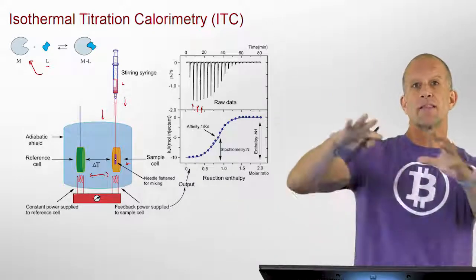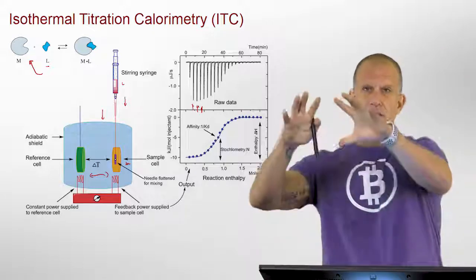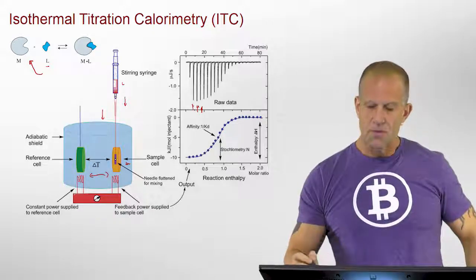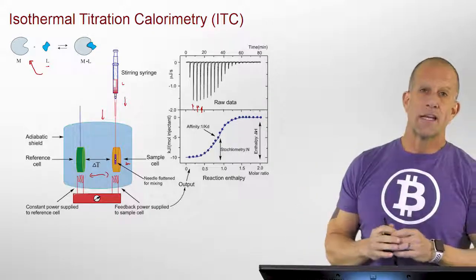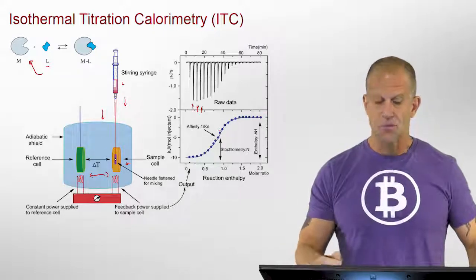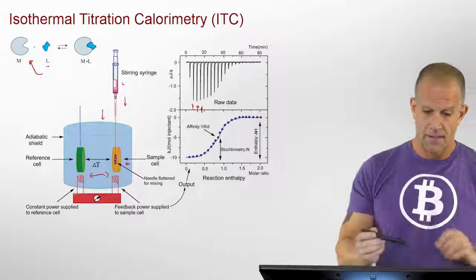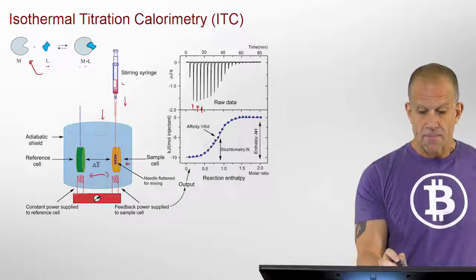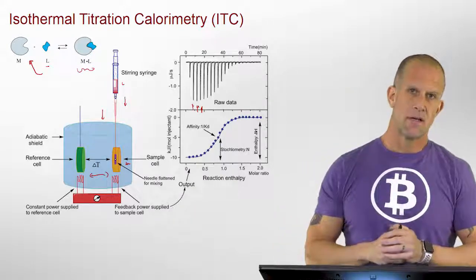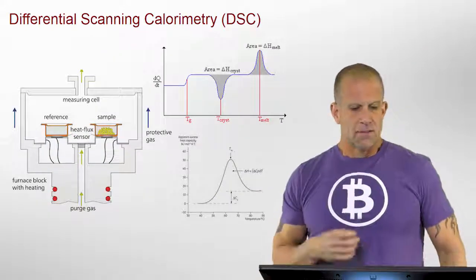But because we're doing this not only under constant pressure but also constant temperature, this is related to the change in free energy or the equilibrium constant. So fitting this gives you directly something about the Gibbs free energy or the equilibrium constant for this non-covalent metal-ligand interaction, which is very useful in biological systems.